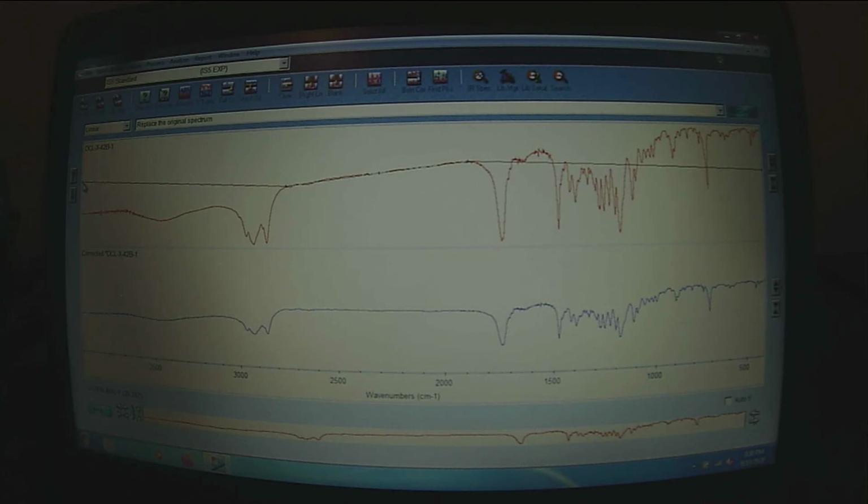If I grab the gray box on the far left and pull it down until it's on the baseline, that, you'll see, corrects the baseline and makes it nice and flat over that entire region. And I can probably put a baseline point here, because that is also likely. This peak is water. It's not part of my spectrum, but I'm going to leave it there for now, and we'll have a different way of dealing with it. I also want to grab the gray box on the far right and drag it up so that I see my baseline, and then put a couple more points in here so I'm knocking off those peaks. So everywhere that the gray boxes is now assumed to be baseline.